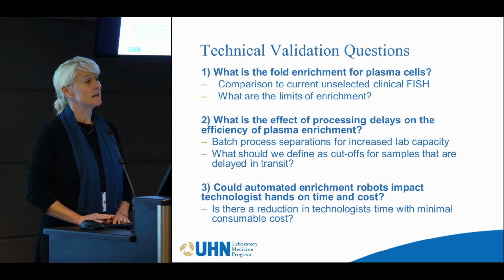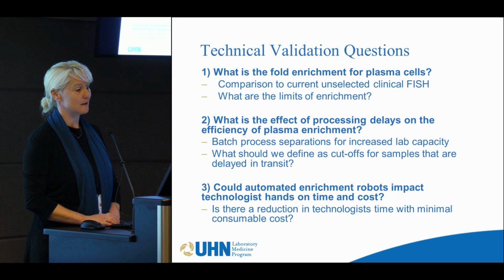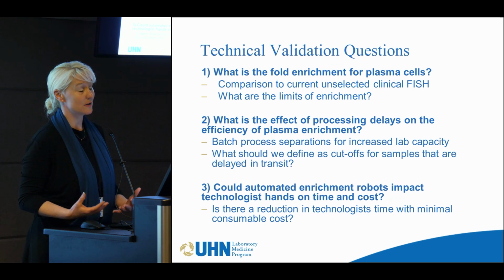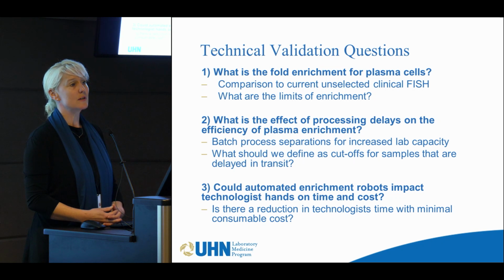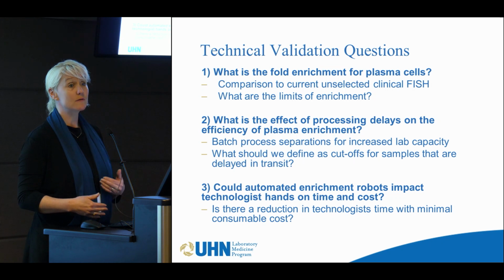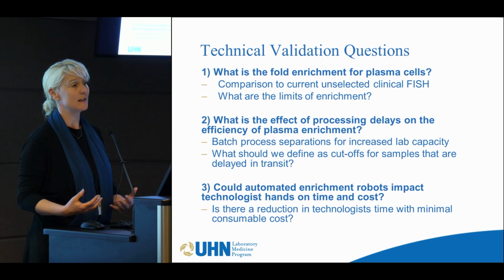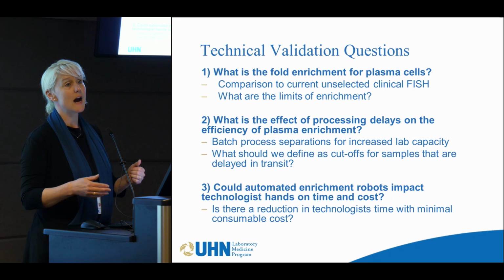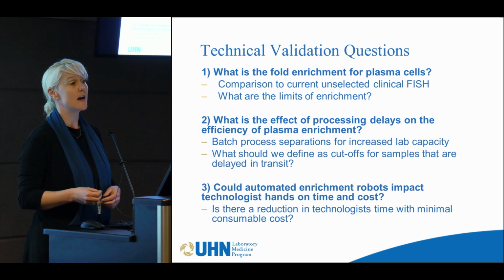Now, one thing I didn't tell you about is when we receive our samples. The first time we were talking to the company, Miltenyi, we were telling them we really want to determine whether or not we could batch our samples, because just for workflow, this is going to be challenging. We're already quite busy, and how can we limit the amount of time we need to do this? Could we batch our samples?